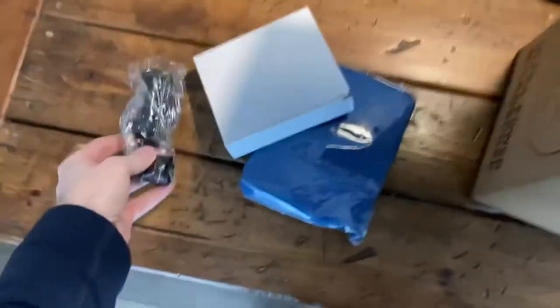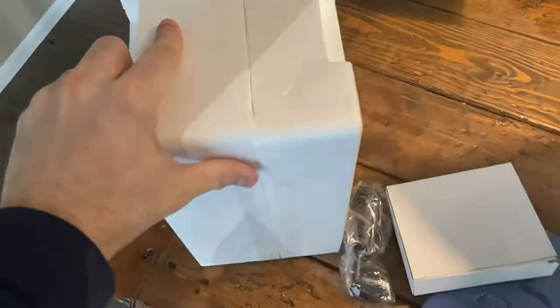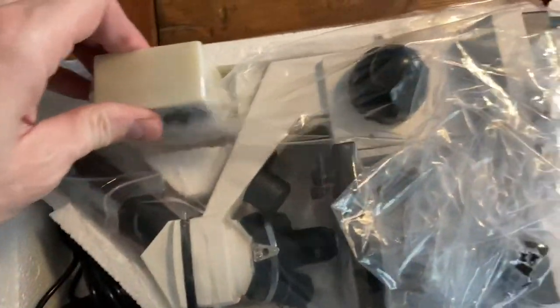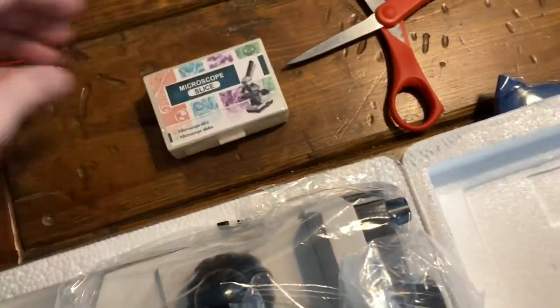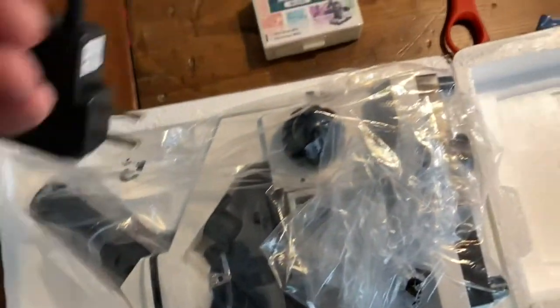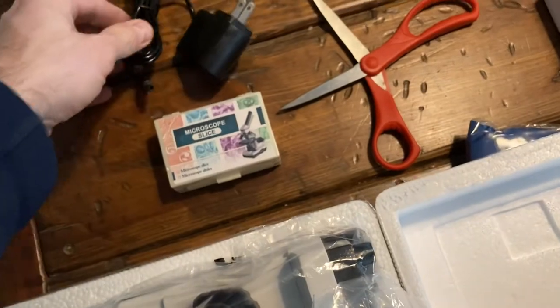We were looking for something with incredible optics — I didn't want something too dark or too fuzzy. That's the point of a microscope, right? But you'd be surprised how many crappy microscopes there are out there for kids at the lower price range. We also wanted this to be an investment, something our six-year-old could use in future years, not just as a little kid.